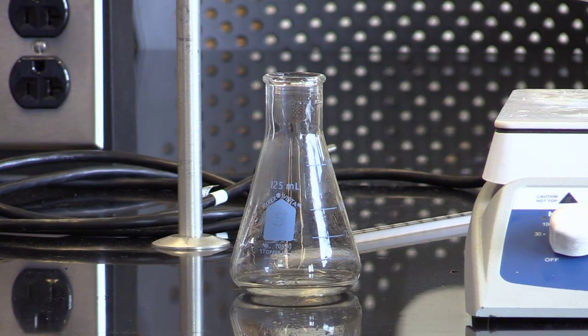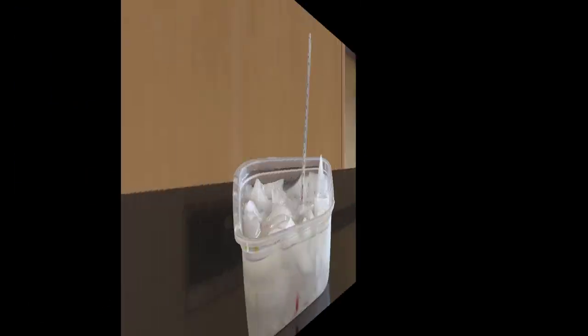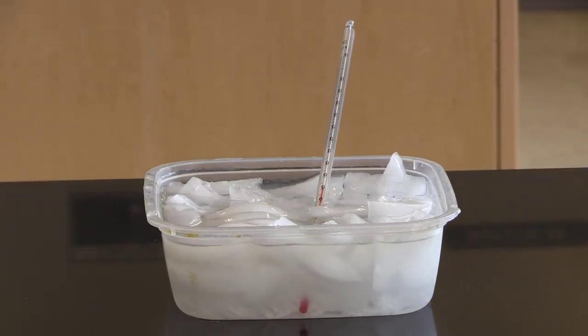As it is cooling, I will set up the rock salt ice bath. Having a rock salt ice bath, the temperature should get pretty cold, around minus eight degrees Celsius. This is evidence of the colligative property freezing point depression. When the particles of calcium chloride dissolve into the water, the solution can have a lower freezing point.